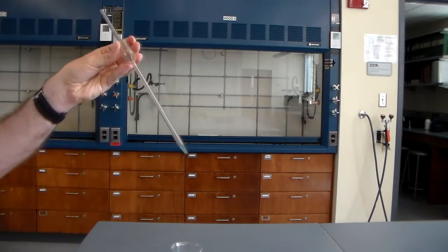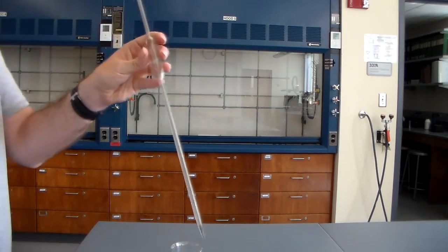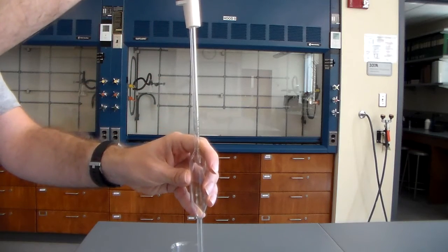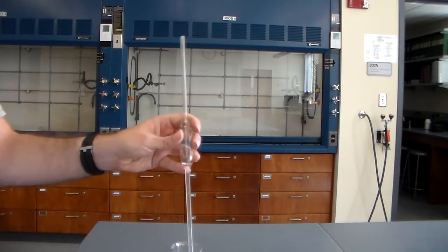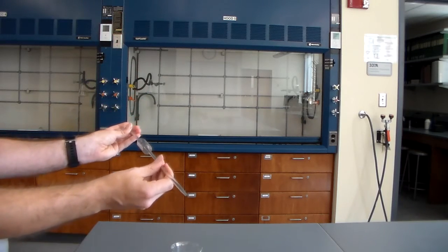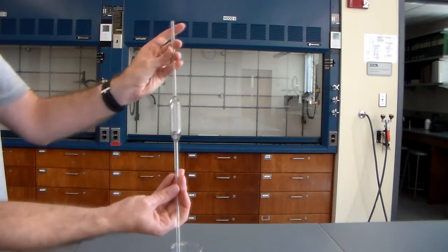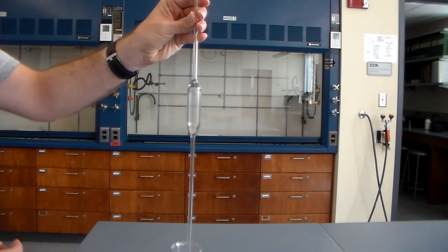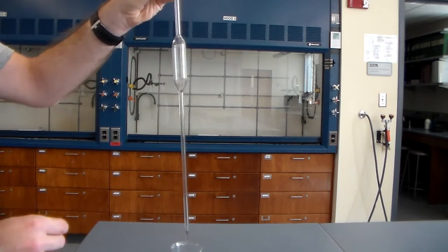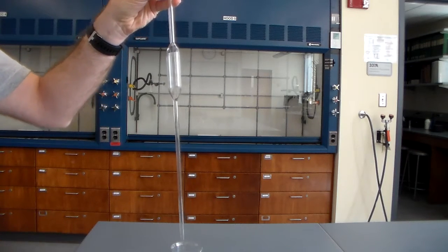So then at the end of the day, when you are done with this, make sure that you rinse it out with water, and that's the same procedure that we started with. So again, you will just go there, suck up the DI water, make sure you hold it over your waste container and spin it around a little bit, and then just let it drain. So this way it washes out and is nice and clean for the next person. Okay? And that is how we use our volumetric pipettes.